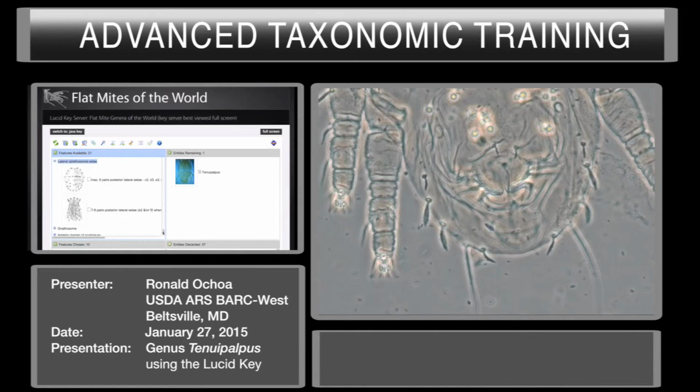Now, the lateral opisthosomal setae, we know it has 7 or 8 setae. Okay, I think I know what is going on. Now, the gnathosoma, the number of palp segments is important now. See, the normal palp could be 1 segment, 2 segments, 3 or 4.